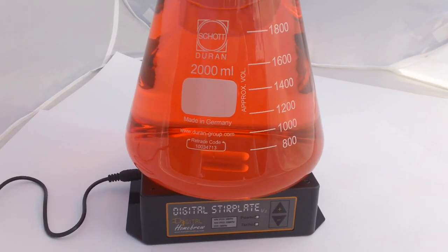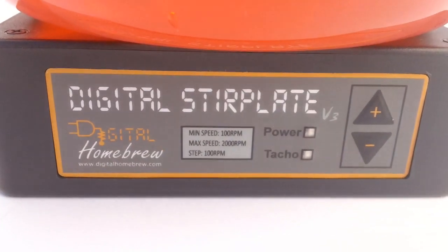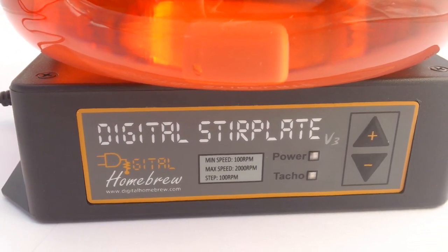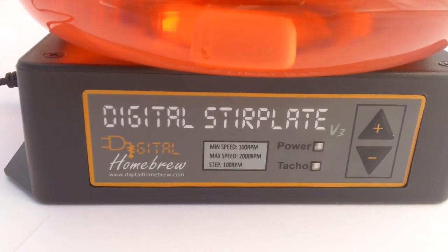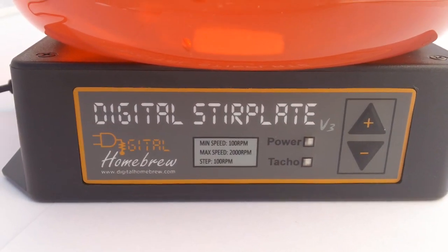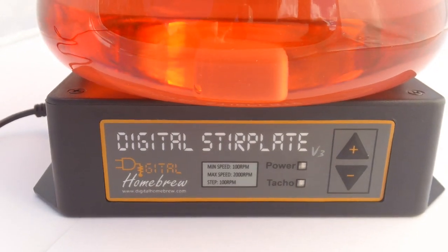Hi, it's Michael here from digitalhomebrew.com and this is the new digital stir plate version 3. It's a slight evolution of our stir plate line — this is the third version we've done. It doesn't actually have any new features that we didn't have in version 2. It's just a new artwork as you can see, and we've made some improvements to make it lighter so we can post it more easily.